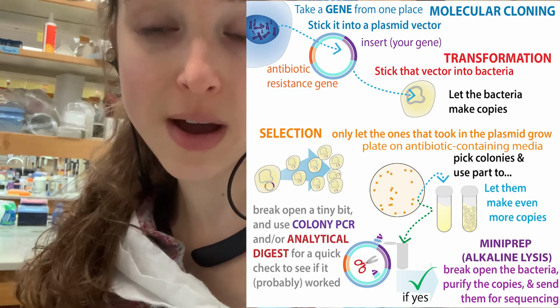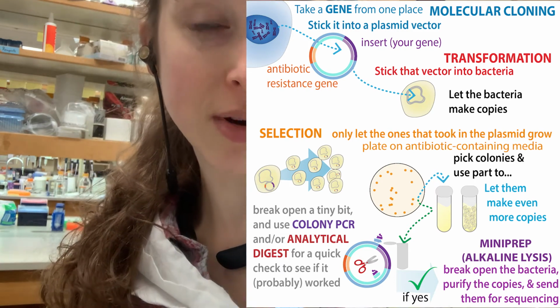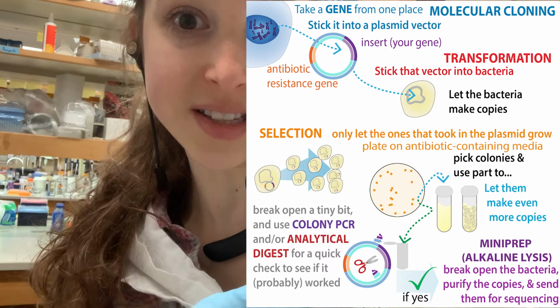But in order to do all that, we need to make sure that our cloning actually worked. So we need to make sure that the gene that we put in actually gets into the plasmid, and then that plasmid gets into cells.